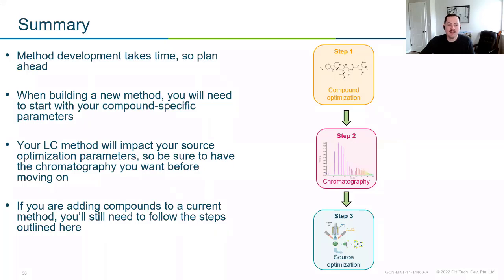But regardless, plan ahead. Method development takes time. And since we live in a world where there's a bit of regulation, which we all know, once we validate a method, it becomes very hard to change. So make sure that you're happy with your method from the beginning.